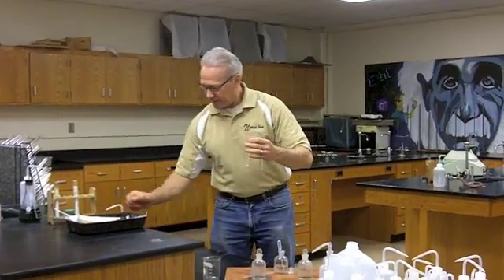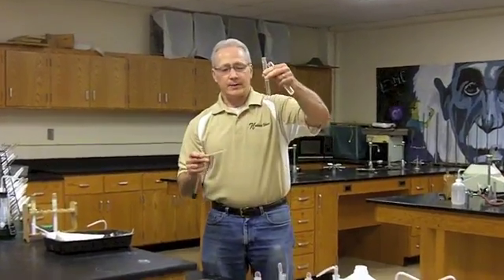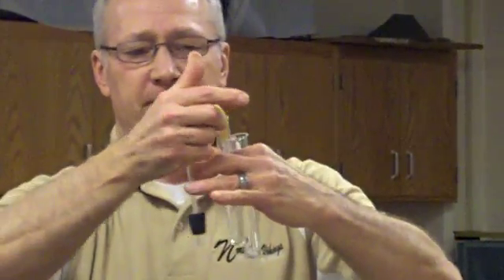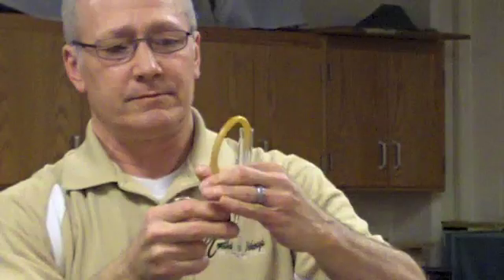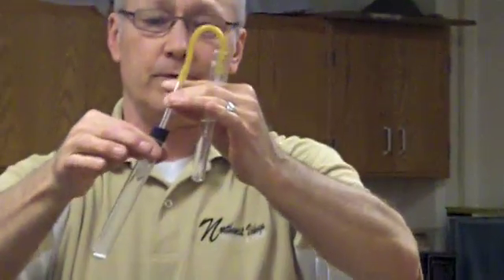The directions then tell you you're going to take the tube that has the calcium hydroxide and put the glass end inserted in there. And it's going to take some manipulating with your fingers to learn how to do this. So you've got that ready to go. And this end must be inserted in here when you do the actual test.